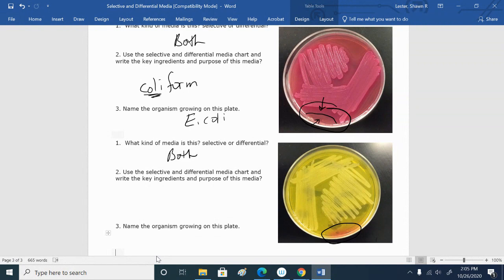So remember, it's the agar that turns yellow on this plate. And this was just one organism put all over this plate, which is why the whole thing is now yellow, because it's fermenting mannitol and making lots of acid. But this also shows a potential problem, because in the actual experiment that you would perform, you're putting 4 different organisms on this plate.